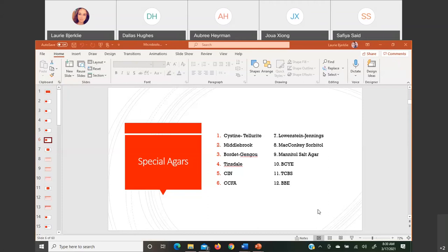That's okay. So this one, BBE, is full of bile, and Bacteroides love to grow on bile. So it needs the presence of bile. Yep. So it's Bacteroides, which is your number one anaerobe, besides the C. diff stuff. As far as anaerobic infections, other than C. diff, it is your biggest cause of anaerobic infections. It's very yucky smelling. Well, all anaerobes are yucky smelling, but okay.